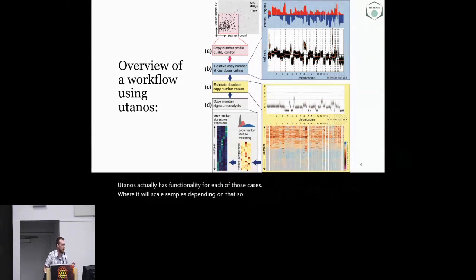For samples that are just too low cellularity, too non-clonal, you do get very, very messy profiles. And in those cases, shallow whole genome just doesn't have enough information present for you to scale to the true ploidy. And it's tough to really say what the true ploidy is, because it's really a mix of diploid and tetraploid and quadruploid. In that case, maybe shallow whole genome just isn't the right modality. You may need to section that tumor differently or study it at the single cell level, because you need more information to resolve it.